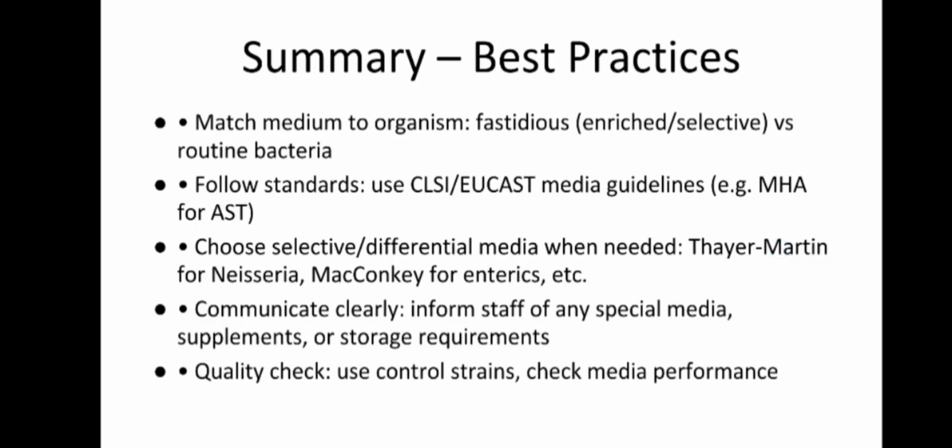So that is it for today. I'll try to make it a bit better. So basically you match the media to the organism, whether it is fastidious or aerobic or anaerobic. Follow standards, always use CLSI or EUCAST media guidelines. Choose selective or differential media when needed. Communicate clearly, inform staff of any special media, supplements or storage requirements.